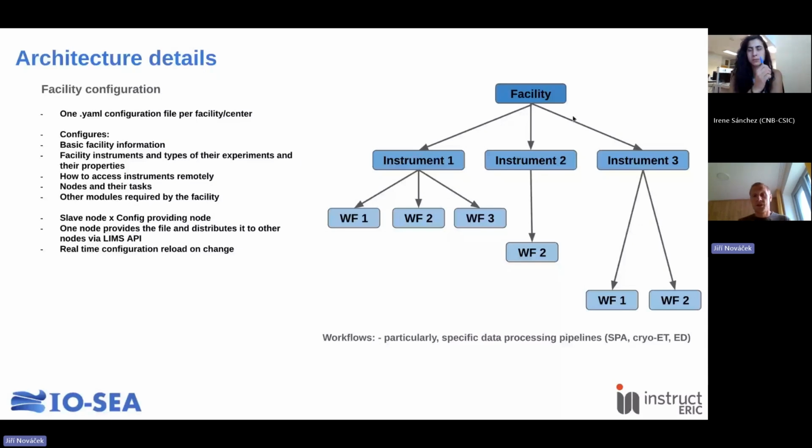For each facility, we can define multiple instruments, and if needed, each instrument can have its own workflows. These are particular workflows related to data analysis. In the case of EM, this would be either single particle, tomography, or electron diffraction, for instance.